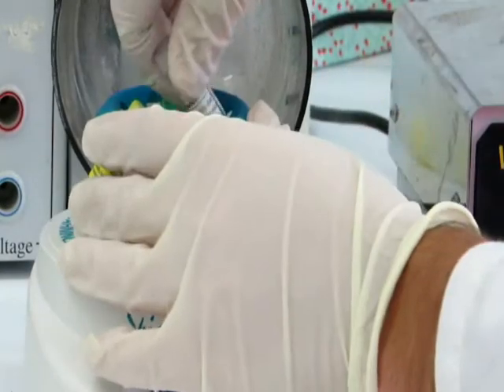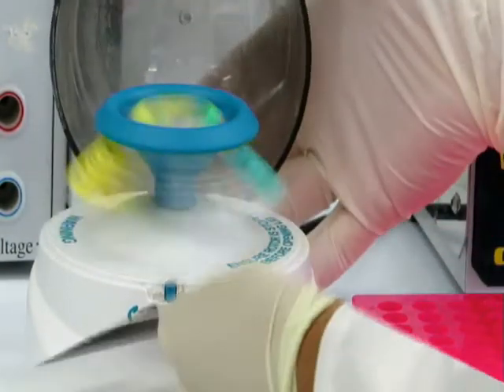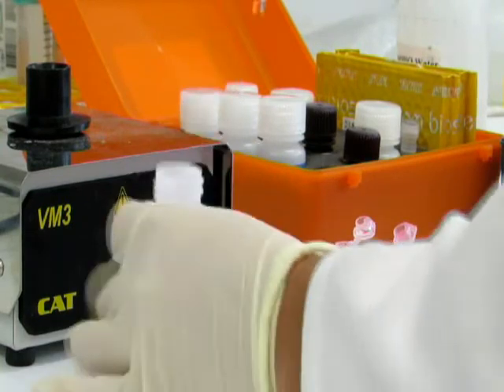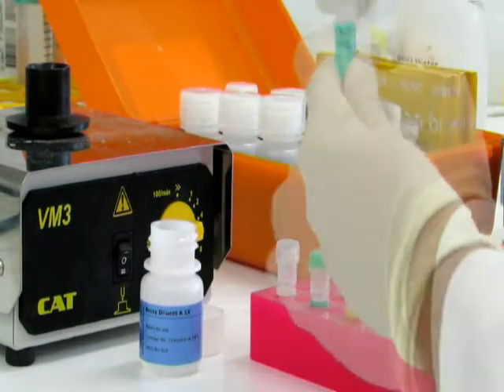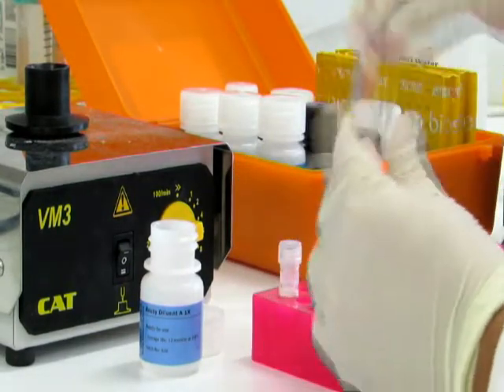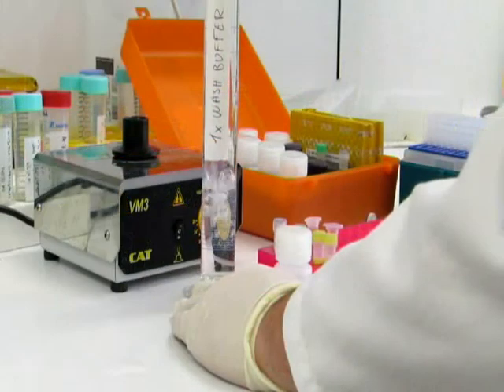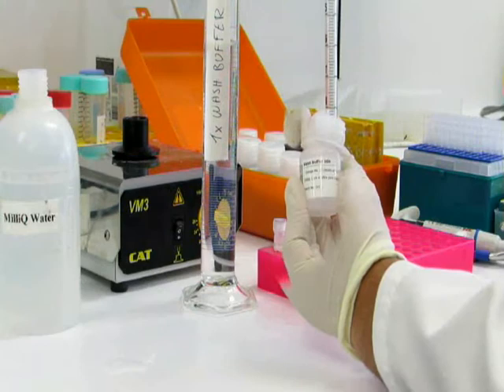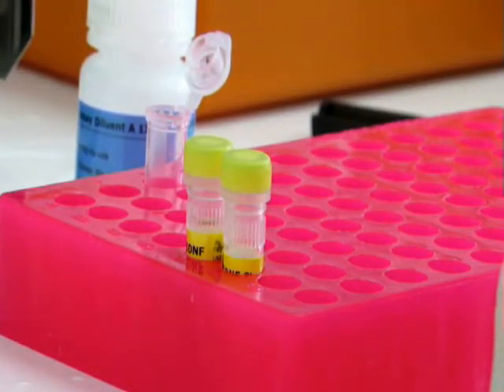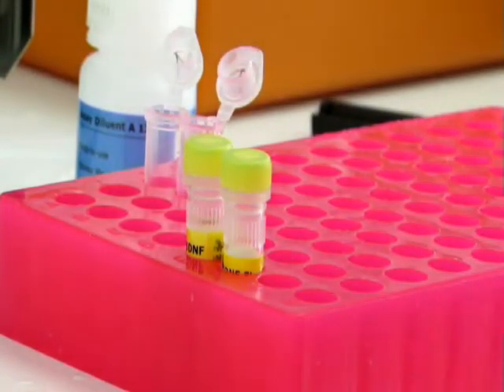Centrifuge all kit components to collect reagents to the bottom of the tube. Reconstitute the lyophilized standard with the same buffer used for sample preparation. Dilute the detection antibody and the streptavidin HRP conjugate 100-fold with the appropriate buffer. Dilute the wash buffer 10-fold with ultra-pure water. Prepare the dilutions for your standard curve and your samples as indicated in the protocol.